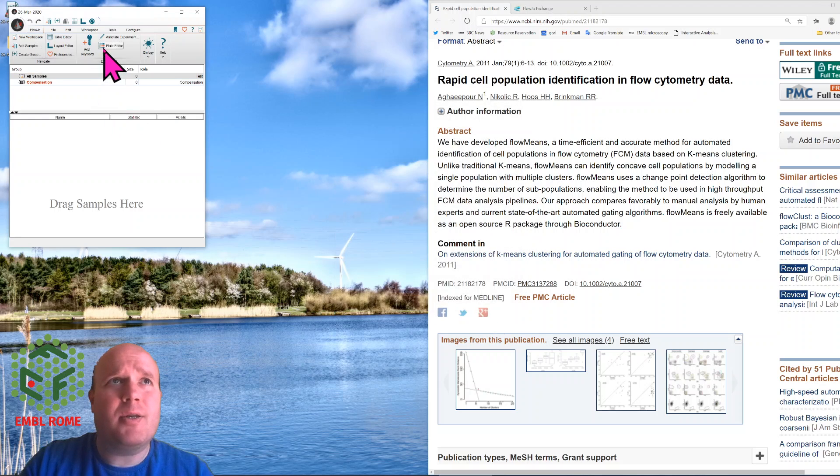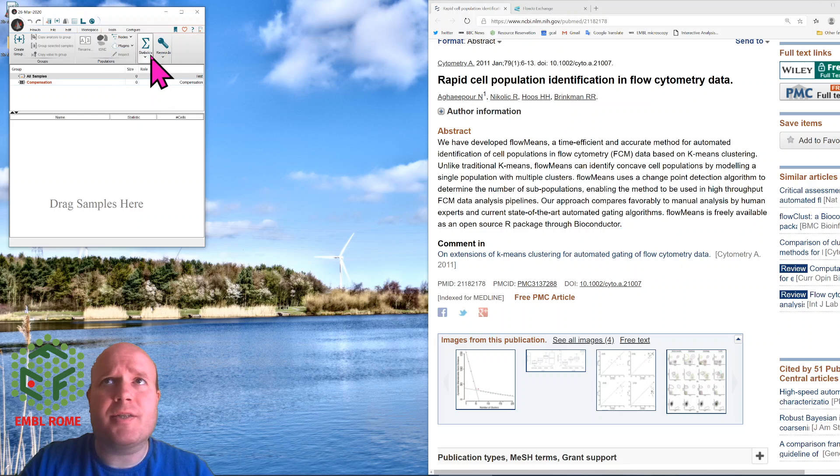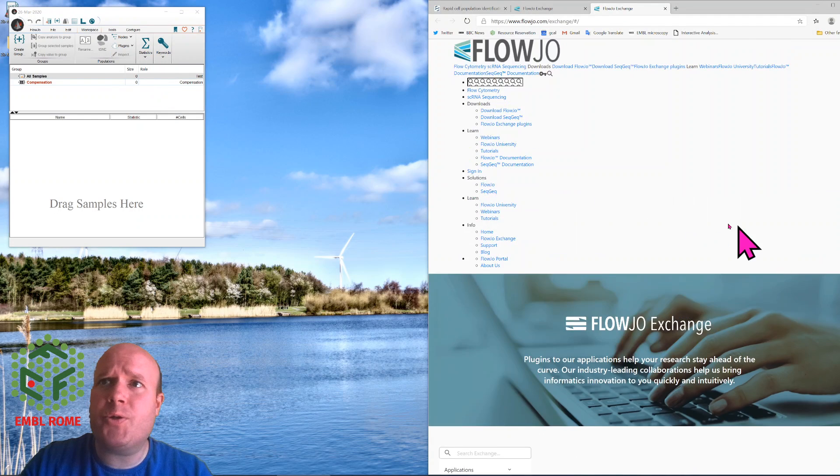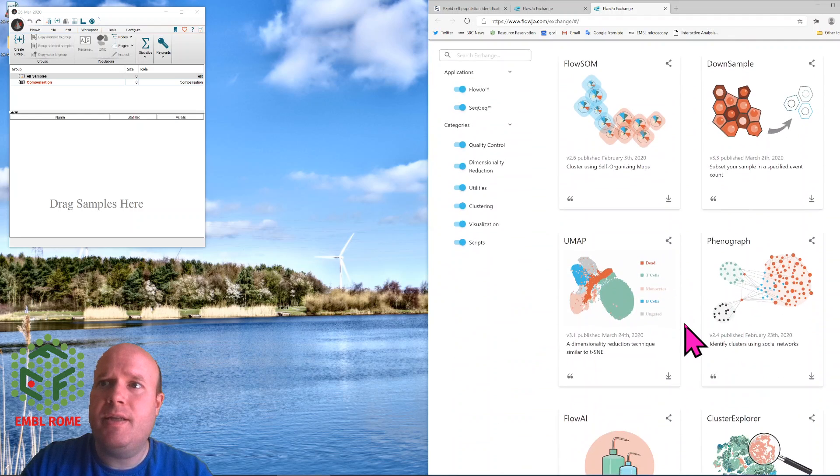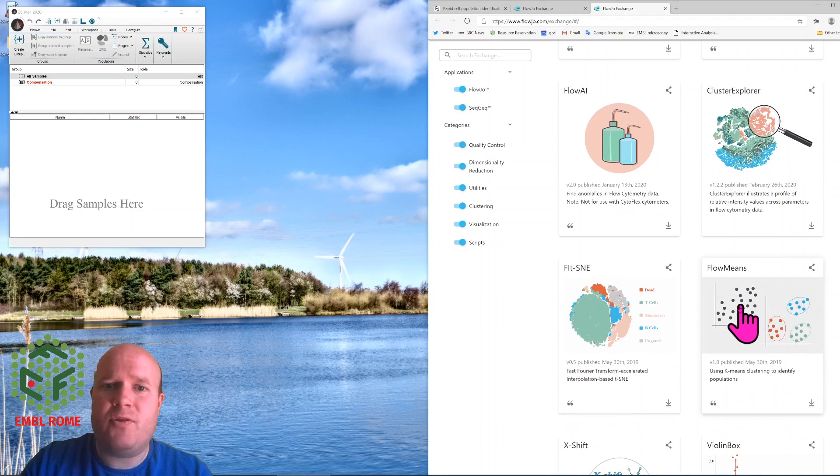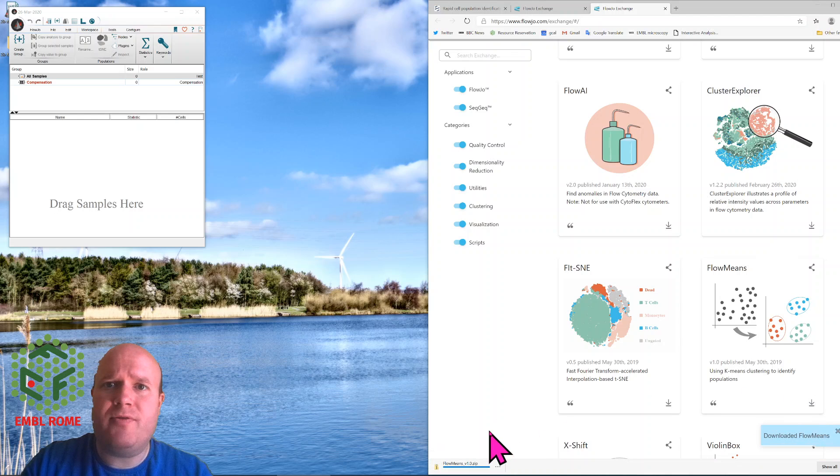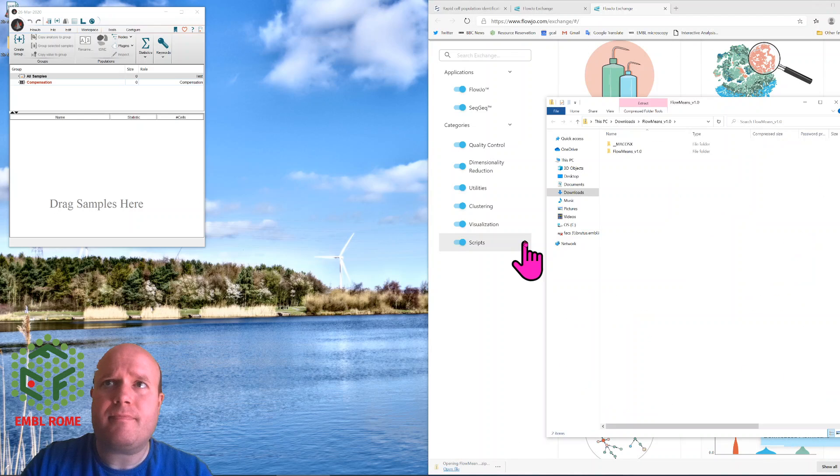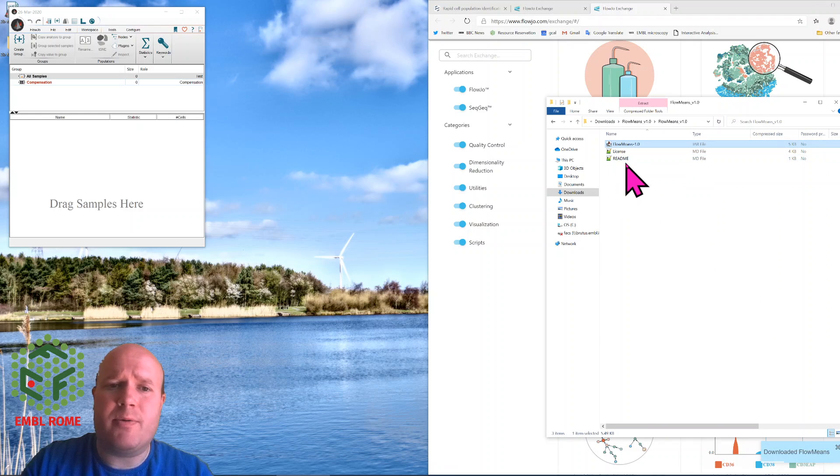Next you go to Workspace, Plugins, FlowJo Exchange. FlowJo Exchange is where all the plugins for FlowJo are housed, and somewhere down here you'll find FlowMeans. You download it, then you open the folder. In the folder you'll find the plugin here, and a README which doesn't really contain anything useful.